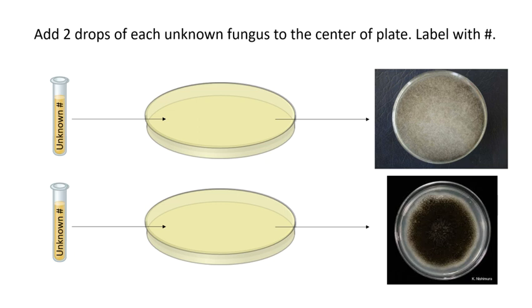And so what you will be provided with in terms of results are the appearances of the spores under the microscopes and a picture of the plate as well, the growth on the plate similar to what you see here. And between the appearance of the spores and the appearance of the growth on the plate, by referencing back to the introduction section in your lab activity, your task is to figure out which 2 unknowns you have been presented with.